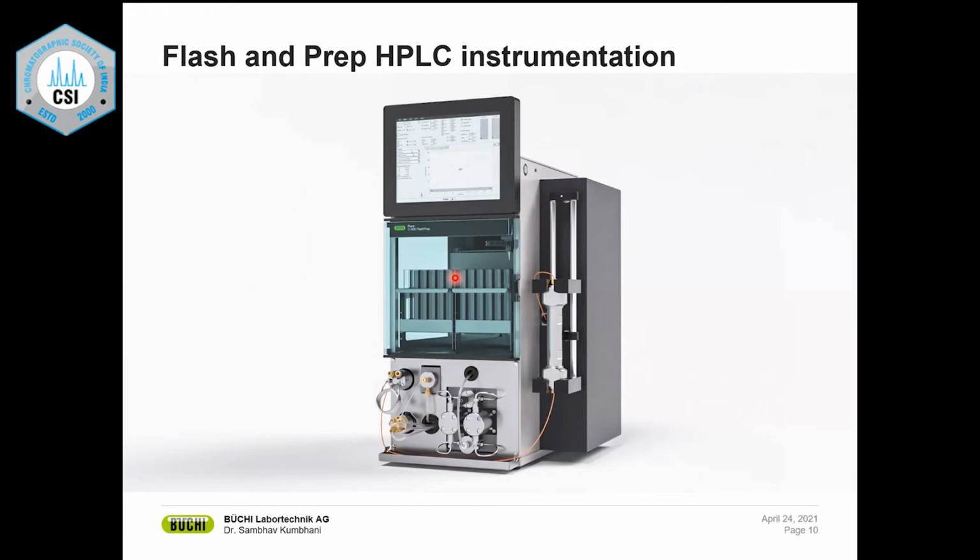Right. So this may look slightly different from what you are used to seeing in terms of analytical HPLC systems, but the parts and the idea or the theory is exactly the same. In an analytical HPLC system, you have different sections. One section will have the pump, one section will have your injection, one section will have your detection system. So it's the same idea, but this is, I would say, a better, sleeker design.